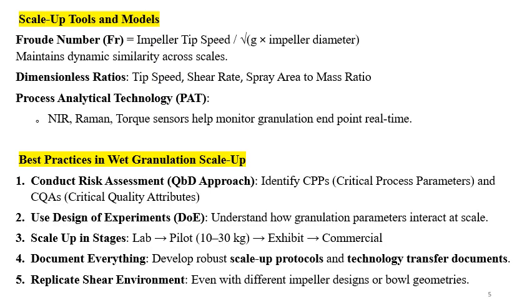Scale up tools and models are there. Froude number is calculated from impeller tip speed and impeller diameter.